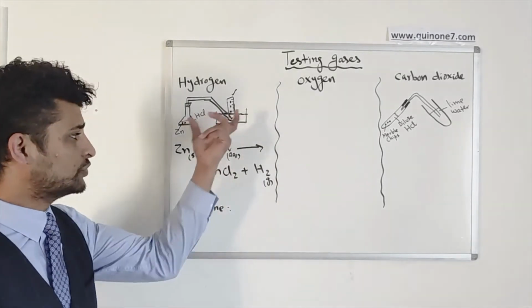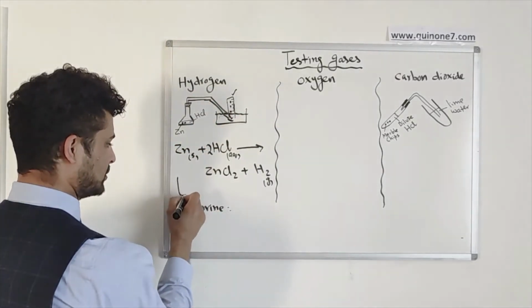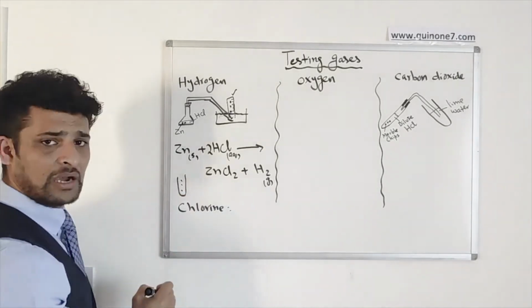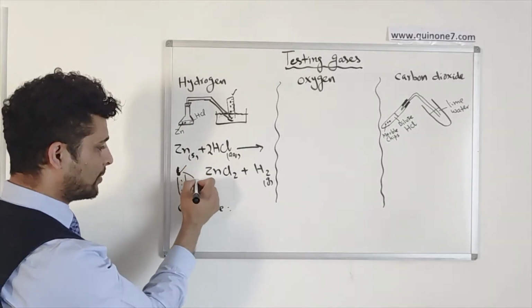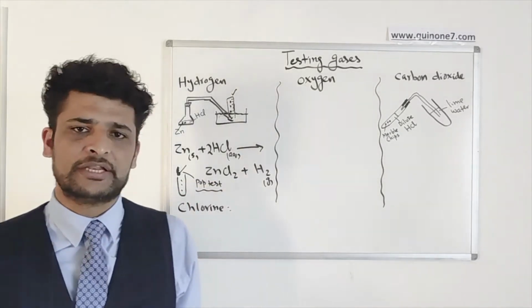Okay. Now once you have that beaker in front of you, you can collect the gas in here. You can take it out upside down, and when the gas is coming out, you take the lit splint in there. And once you do, it will give you a pop. It gives you a pop, and it is called a pop test.